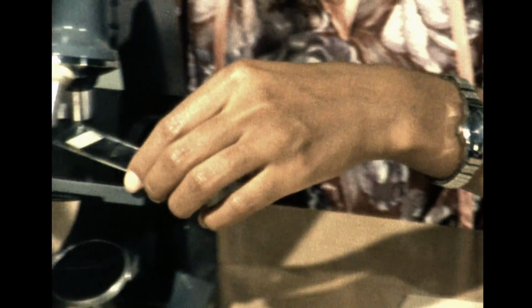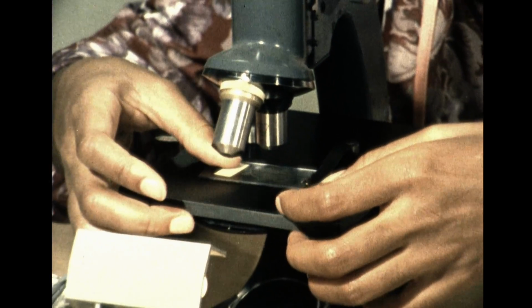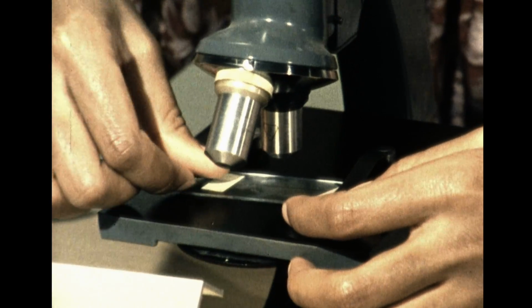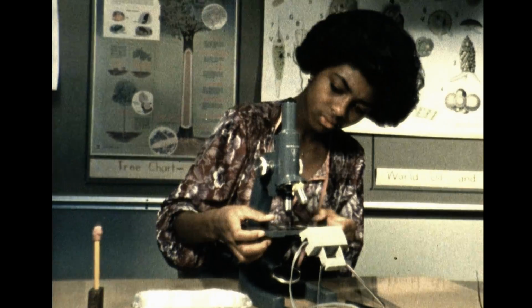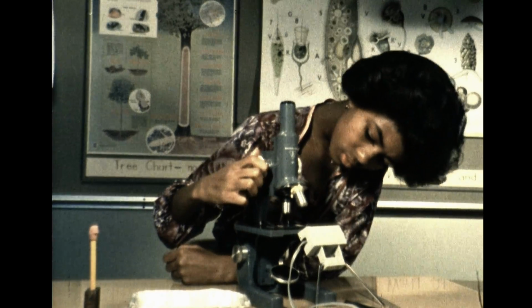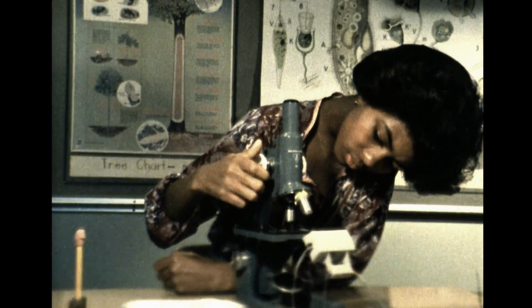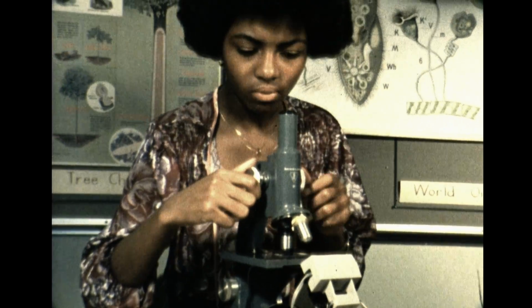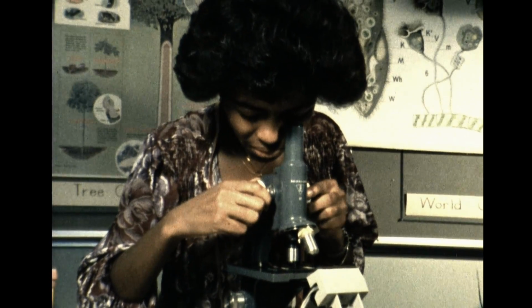7. Put the sample on the stage. Arrest it with the clamps. Make sure the part you want to see is over the window. 8. Lower the lens by using the coarse knob. Stop when the objective reaches a position about a millimeter above the slide.